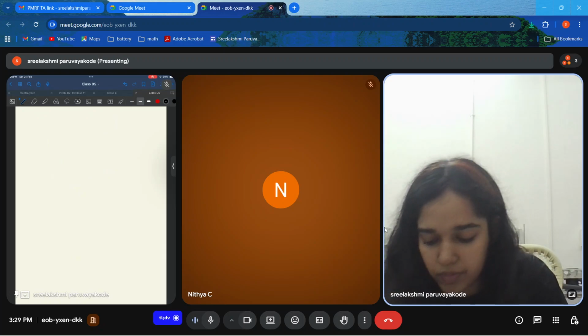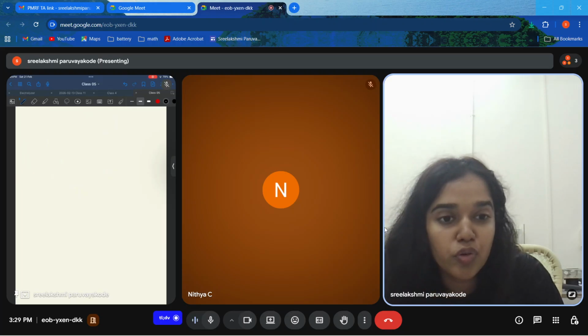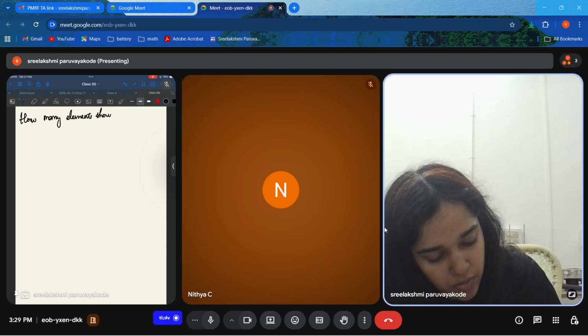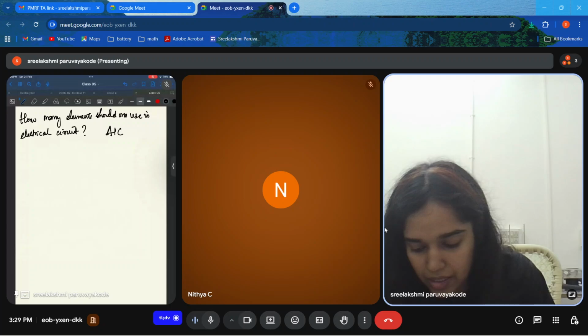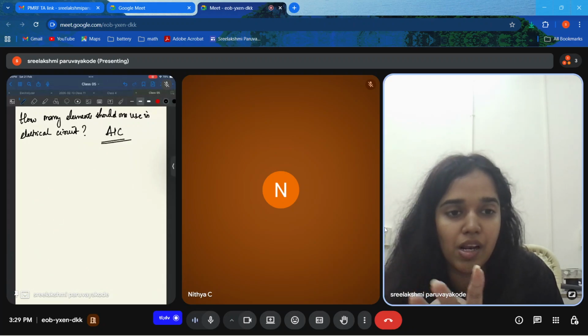Now the next one is, so the question is, how many elements should one use in an electrical circuit? So how to find that out? That is when you'll see AIC coming up. So I'll write a little. The circuit with the minimum number of elements that can fit the data well is what is preferred.